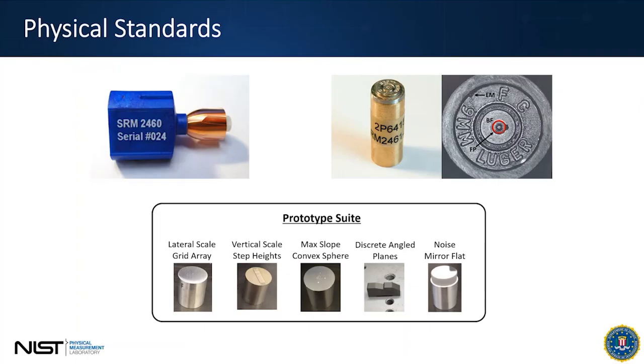Right now, we're getting close to releasing the step heights, and we're working on the lateral scale. So at a minimum, we can allow you to check for the X, Y, Z scales. So that's the end of my presentation.